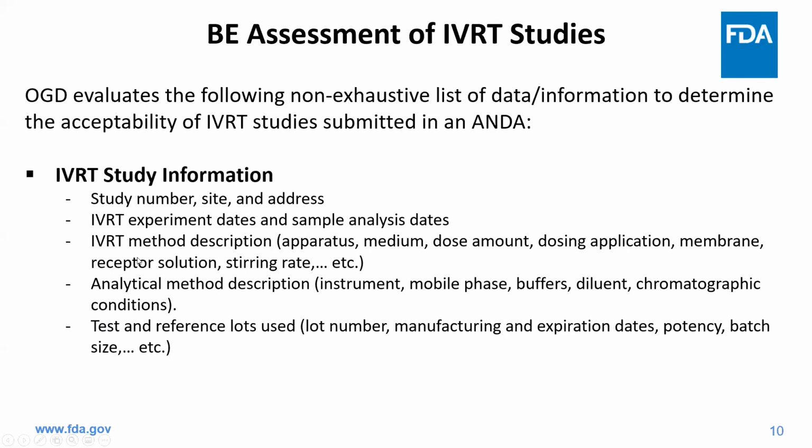The complete information regarding the IVRT method description: the apparatus type used, the drug release medium, dose amount, and dosing application. If the apparatus used a diffusion membrane, we would like details about the membrane and the receptor solution, stirring rate, among many other parameters.